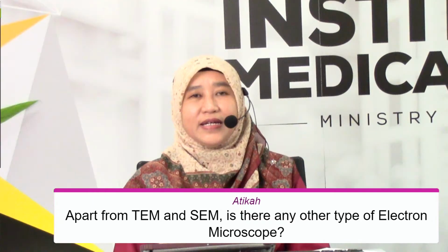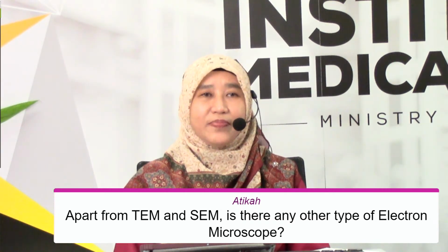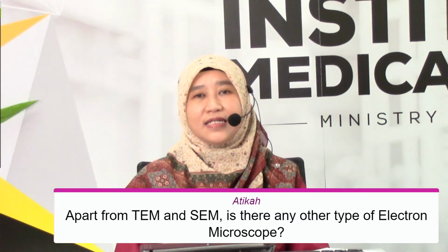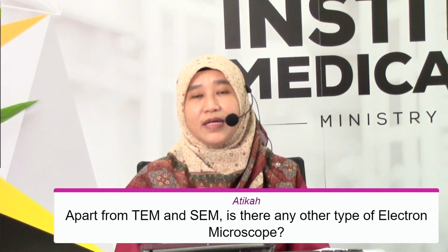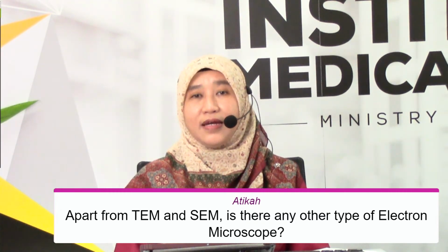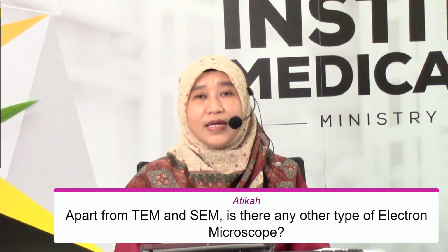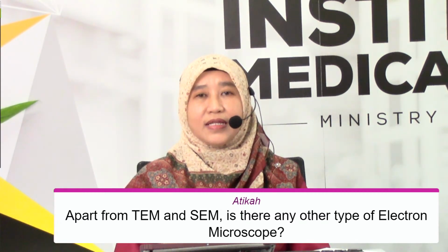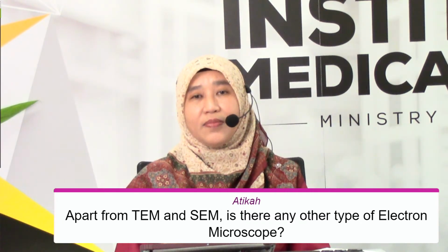Okay, as I mentioned just now, apart from TEM and SEM, the most advanced, the latest in the EM line is cryo-EM. It's another type of EM, and we also have a reflective electron microscope. And I think in the material sciences or engineering part, they have more types of electron microscopy also.